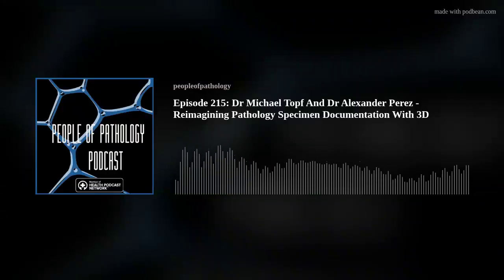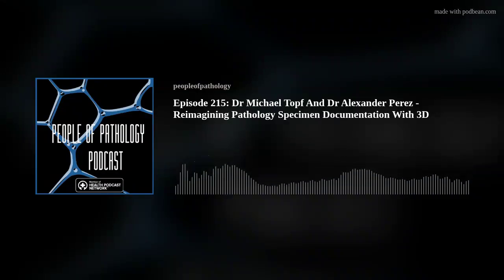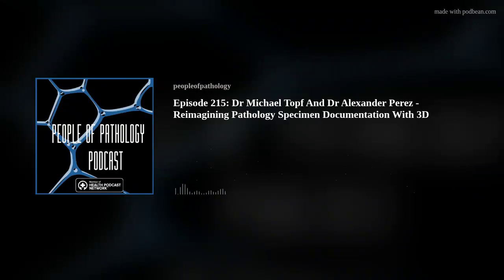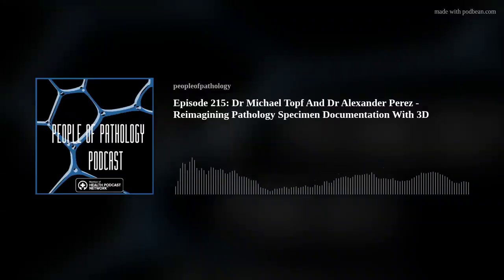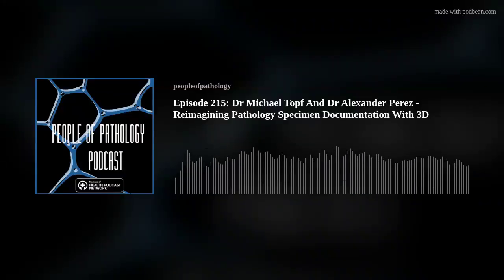So the thing that we're really excited about with our custom software, that I think is a clear benefit over two-dimensional pictures, which at least for my cases are still only obtained, I think, a minority of the time, is the ability to upload 2D microscopic data to the corresponding sections. So you can imagine how impactful and powerful that would be to have a model of your resected cancer.